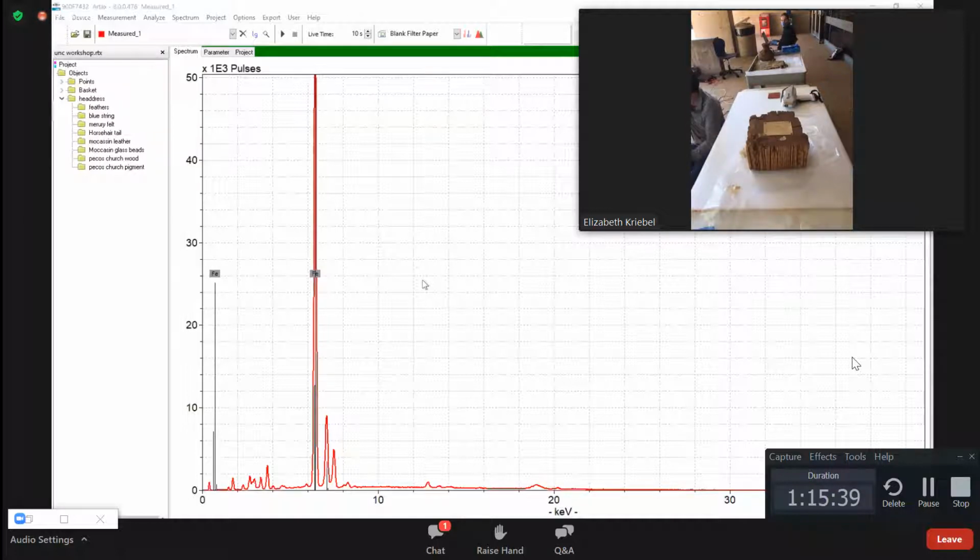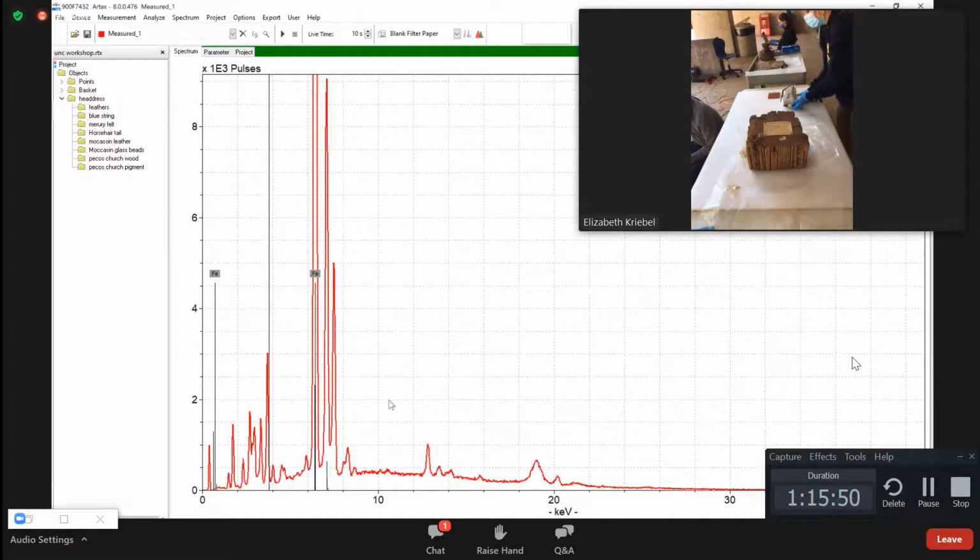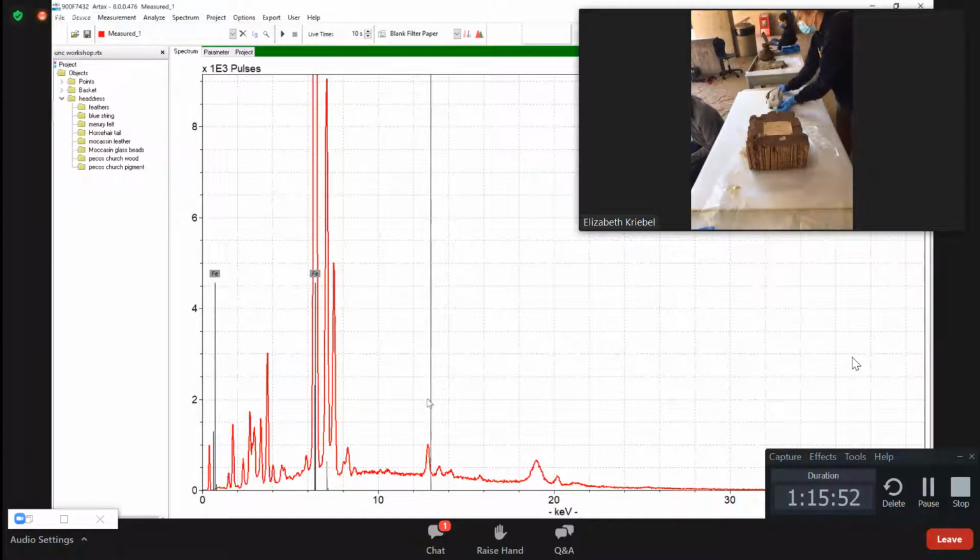In this case though, the metal is iron, so you do have a rust concern. That's surprising. I'm shocked it's not rusty, but maybe it was put on in an indoor building and kept in the Southwest and it's been pretty dry since. No, it is pure iron. Okay. And it's obviously not stainless steel because we don't see chromium. They wouldn't have had that available anyway.